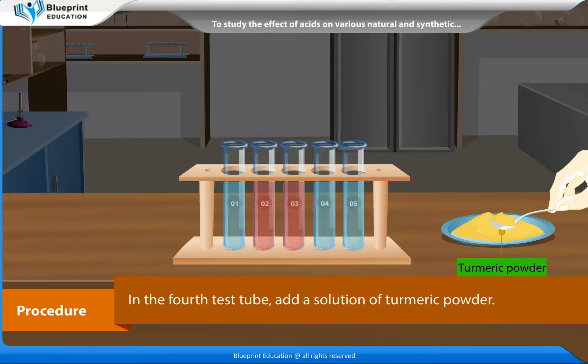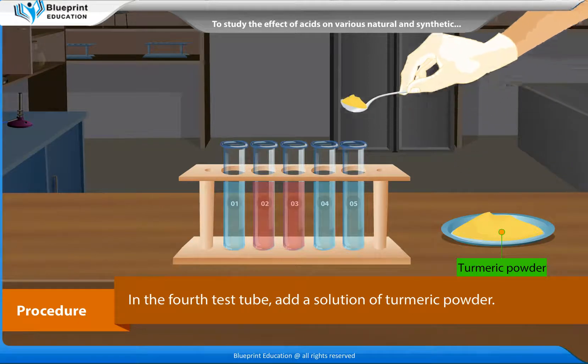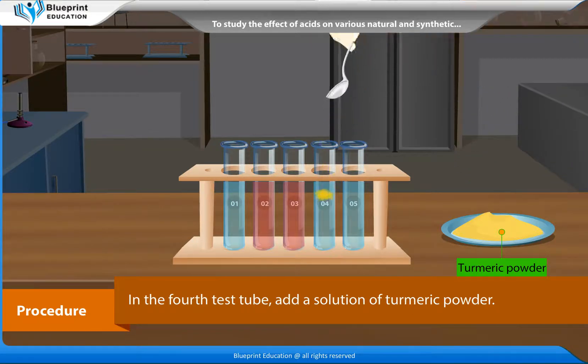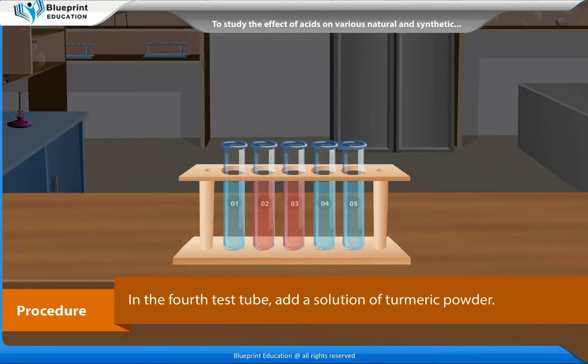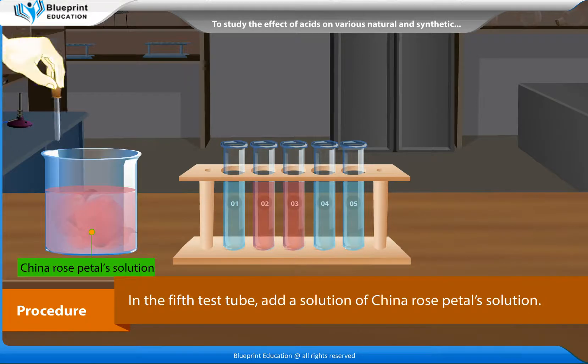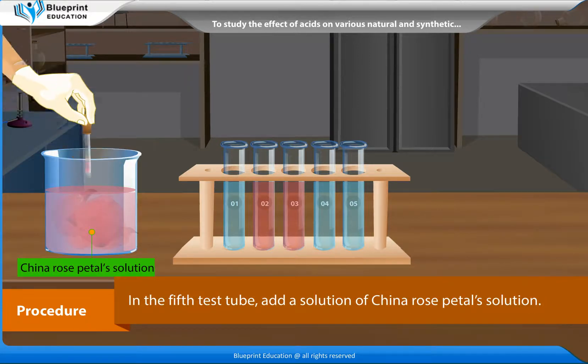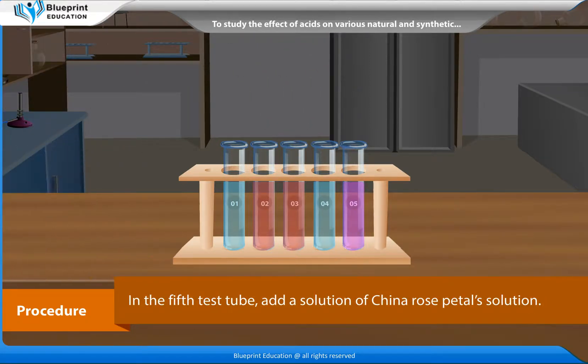In the fourth test tube, add a solution of turmeric powder. In the fifth test tube, add a solution of china rose petals.